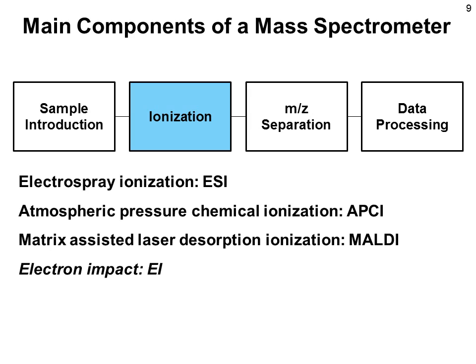There are more ionization techniques, especially for gas chromatography mass spectrometry, like electron impact, where an electron beam is directed at the molecules. We will not deal with those, as those are not so relevant for large biological molecules and also for smaller molecules like metabolites.